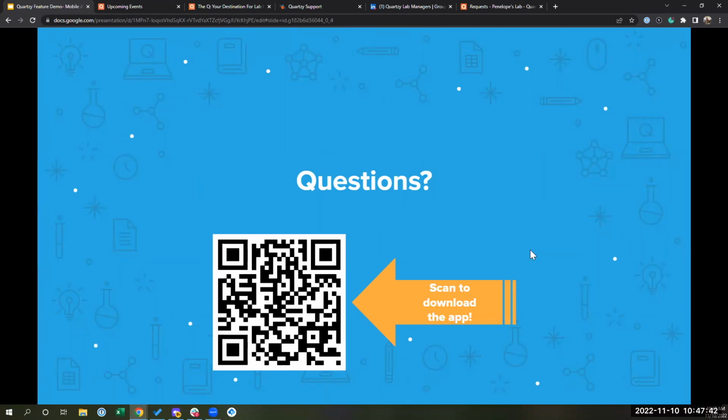Even in that case, if you're able to access, like I guess this involves a phone, but the packing slip interaction, when you click it, it actually prompts you, do you want to take a picture right now? Or do you want to upload something that you've already got stored from your camera roll? So there's various options to access it, but yeah, you don't need a phone, you don't need a mobile device or tablet. Use your scanner. As long as you get that PDF to a web browser, you're able to link it just like Libby was showing.